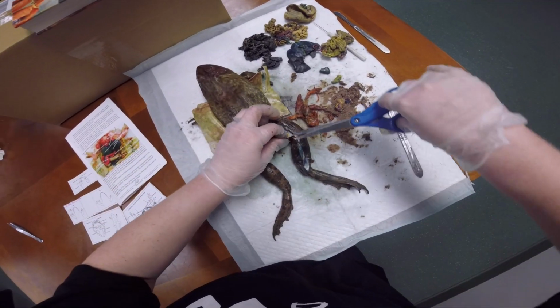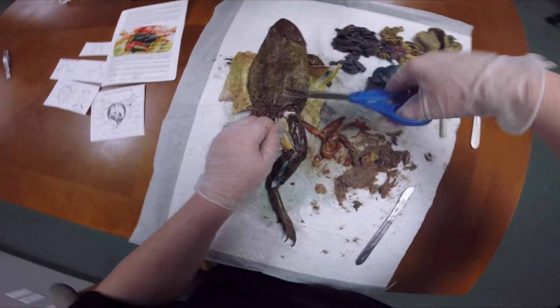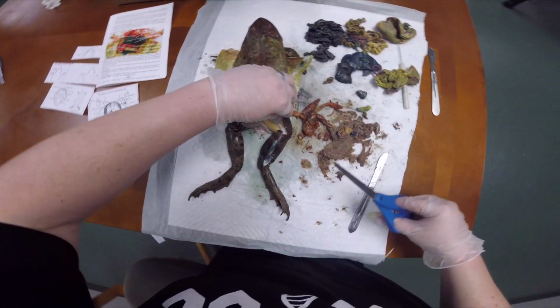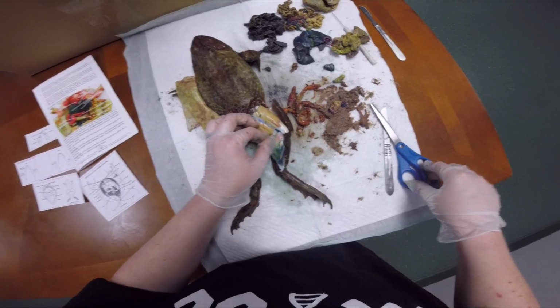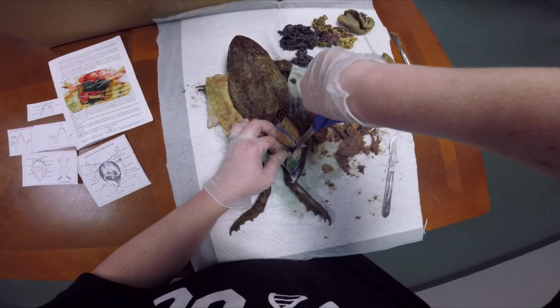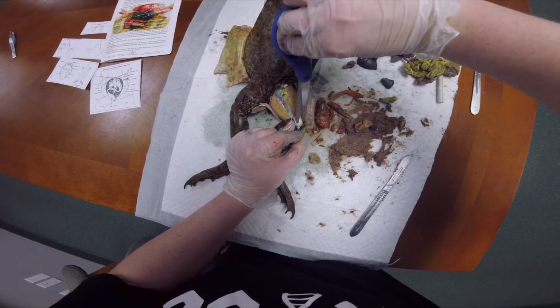Okay, so get that skin out of the way. Alright, so what I wanted to show you was the muscle in their leg, and I wanted to show you the kneecap.